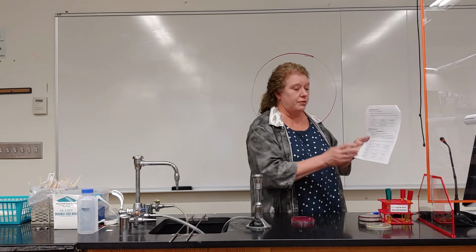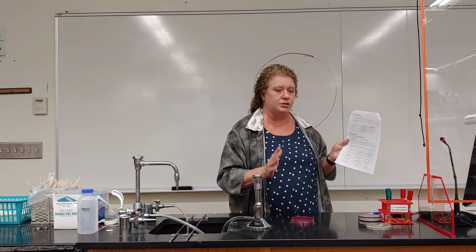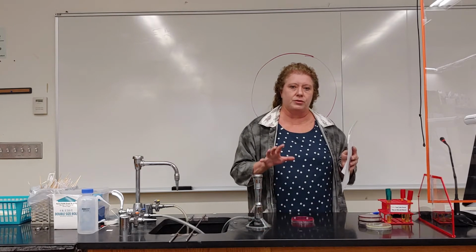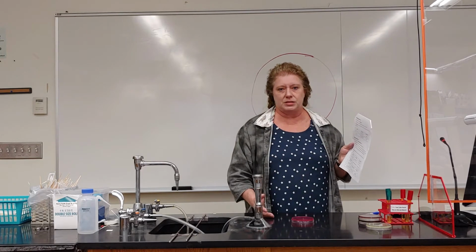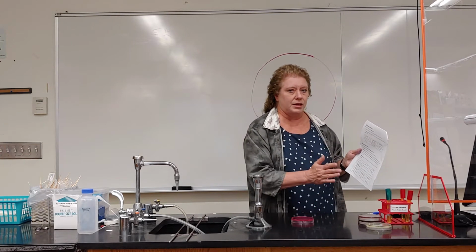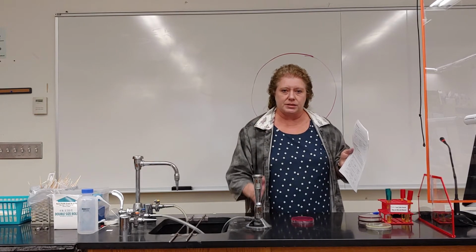Now, if there's growth, good growth, you'll see under B, good growth. That tells you something right there. It tells you, first of all, that the organism is not inhibited by NaCl because it can grow. So that right there tells you that it is a Staphylococcus species. You've already determined something just from growth or no growth. If there's no growth, it's not a Staphylococcus species and it's inhibited by NaCl. If there is growth, it is not inhibited by NaCl and it is a Staphylococcus species.